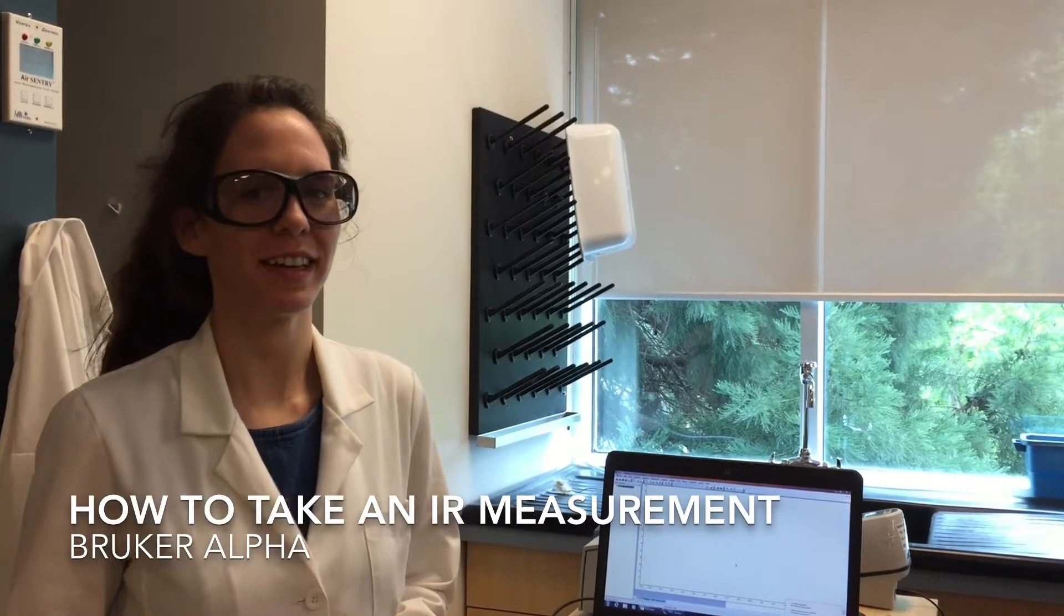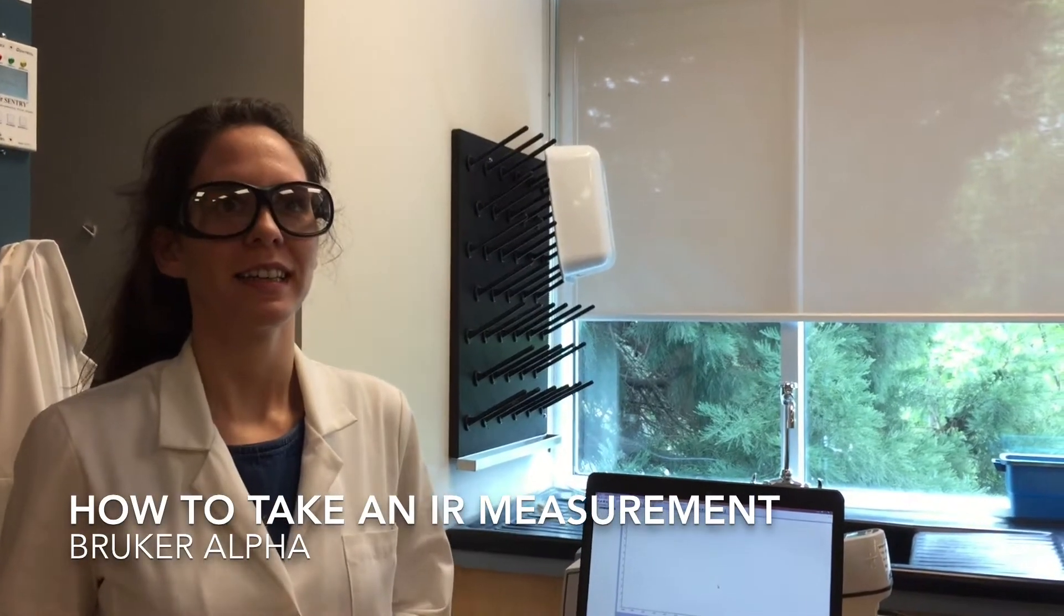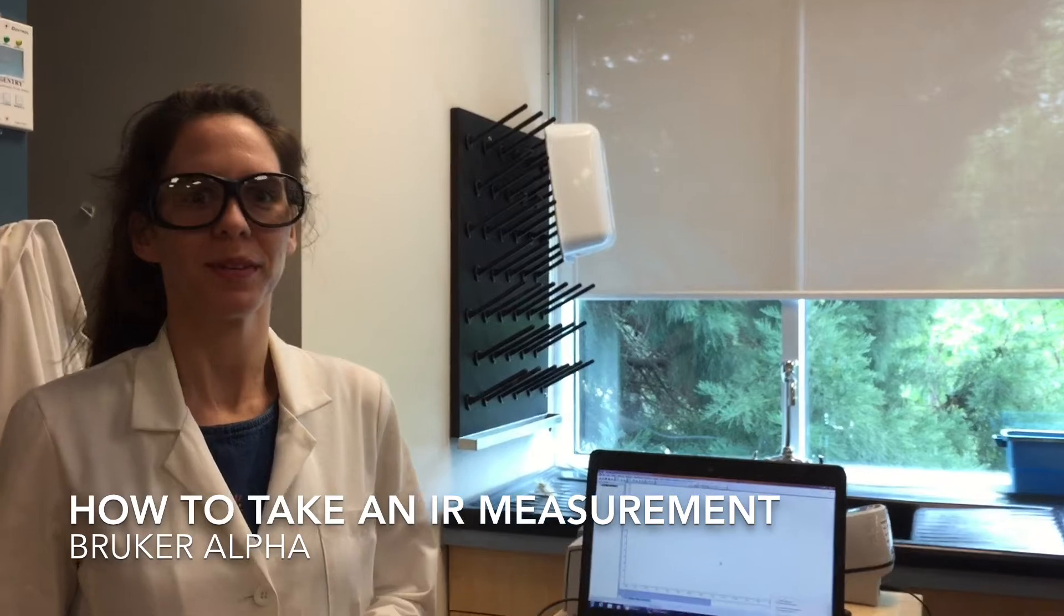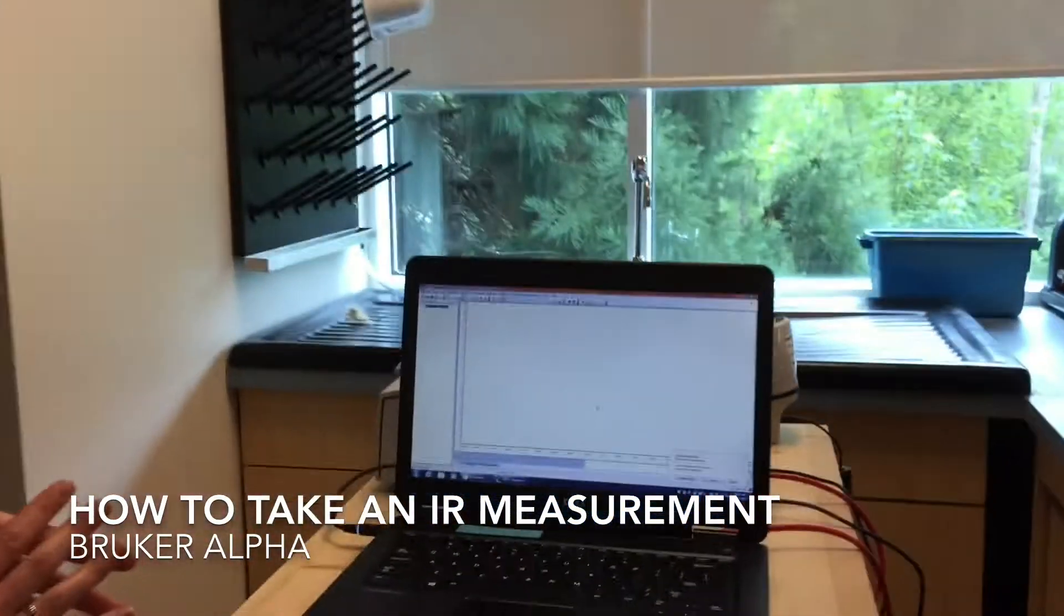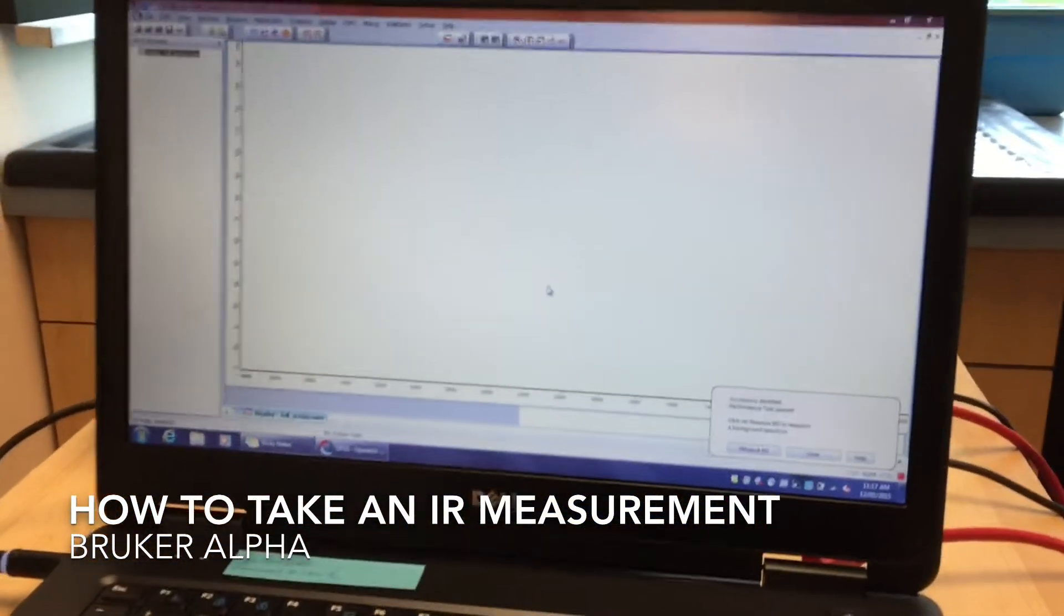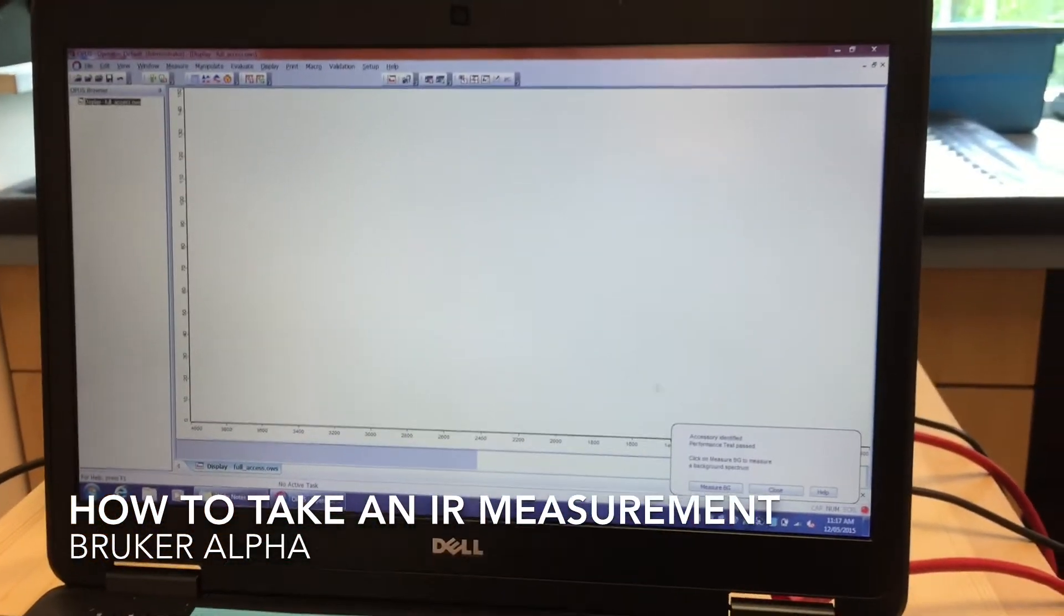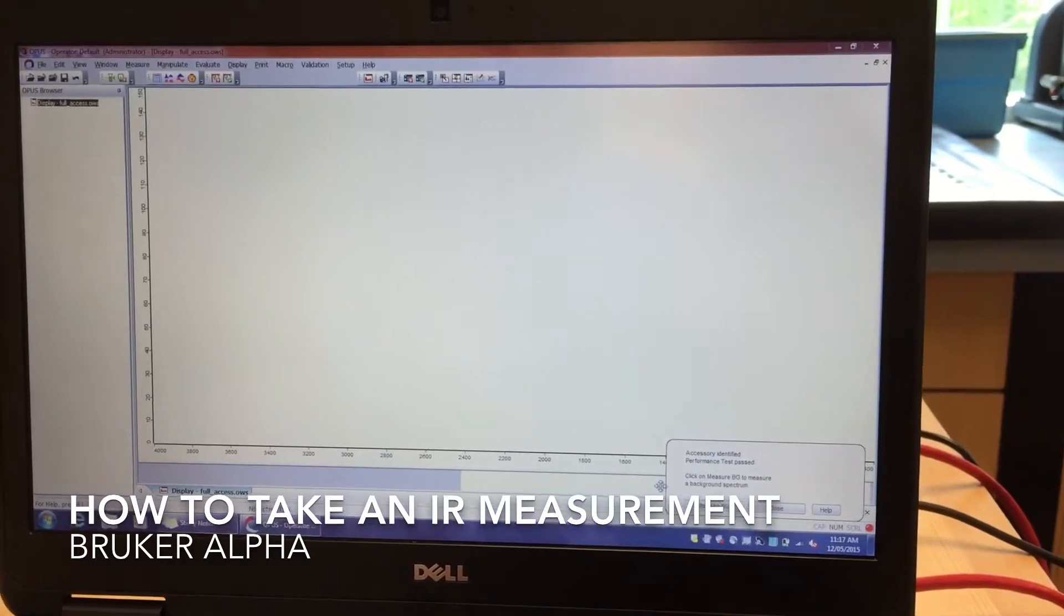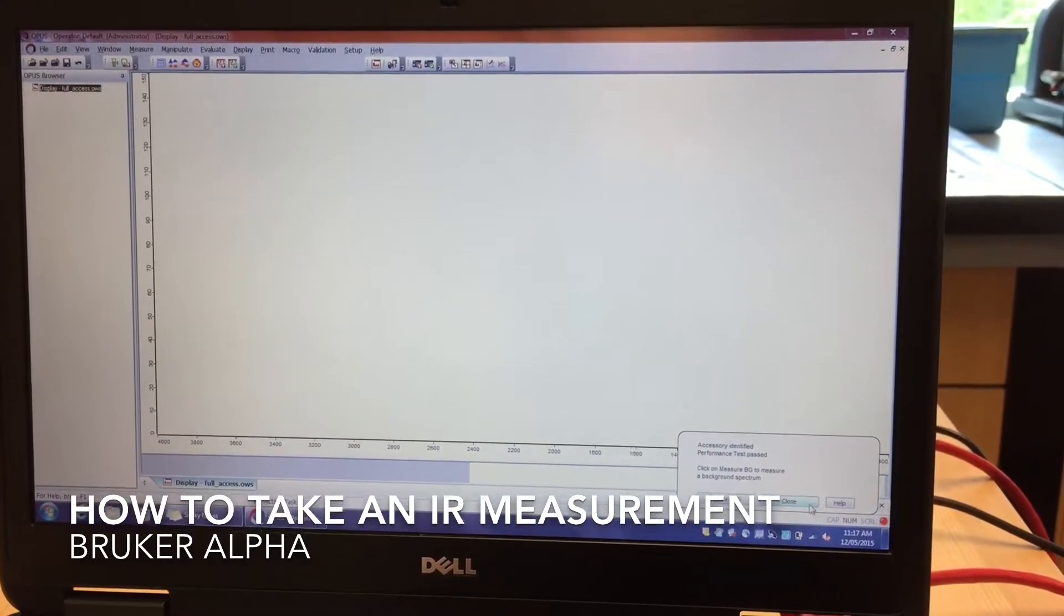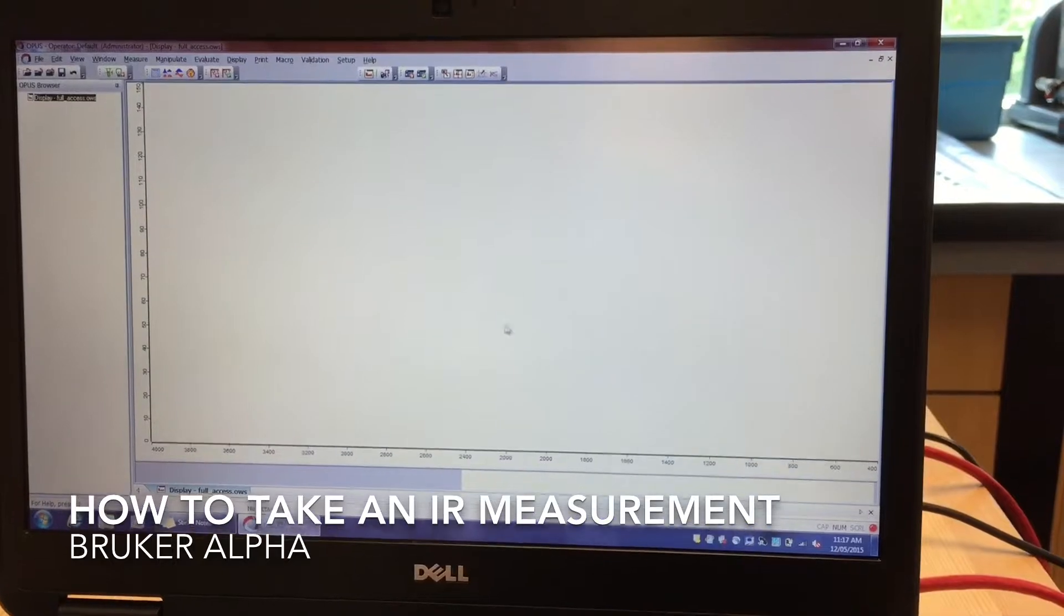This is a continuation of the IR measurement video. The tests have now been passed. As it says accessory identified, the test has been passed. So we can close here.